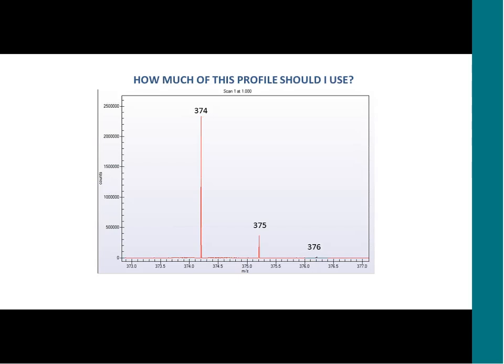And because this is a little bit like adding together scalars times vectors, the 374 peak would pull or contribute to your answer score way too much and basically washes out the contributions from the smaller peaks. So use it for calibration, but that's it. And then you go on to consider maybe I should use 375 and 376. Well, 375, that's going to be due mainly to carbon-13. I'm not going to say it's never useful, but you basically want to try both and see which one gives you the most definitive result.